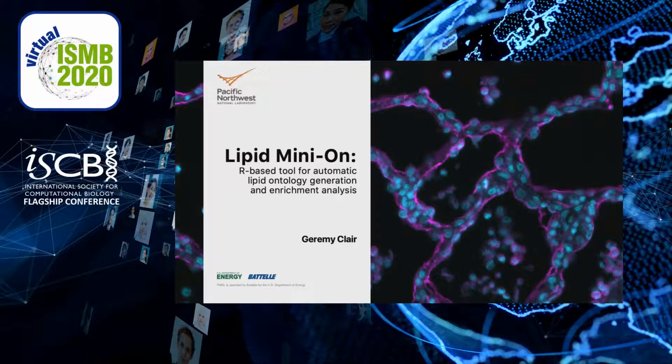Today, I will present to you the tool Lipid Mini-on. This R-based tool is made for automatic lipid ontology generation and enrichment analysis.